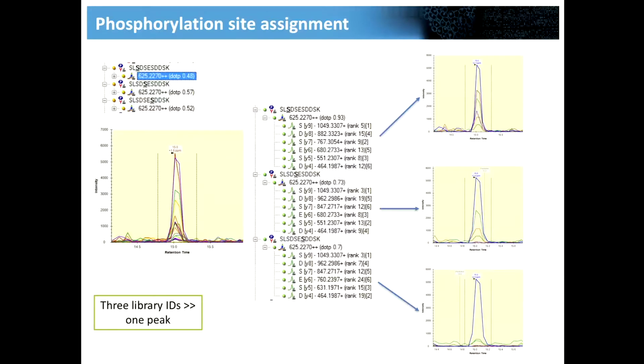Then I would need to look at perhaps other ions and see maybe I can resolve it, but in this case I would say there is more evidence leaning towards this site localization. So I hope that with these few examples, I could show you that site assignment is a bit of a complicated problem. How would we go about it when we have a very big data set?